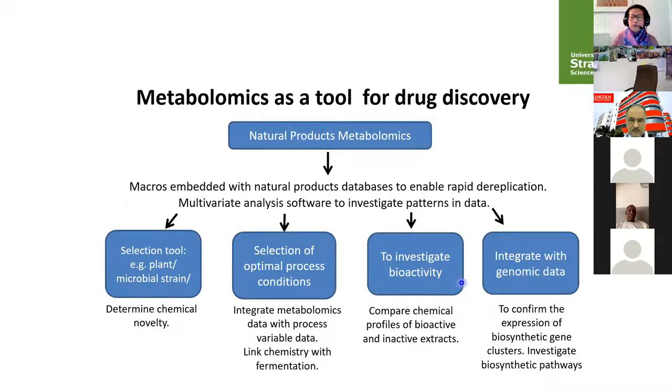Third, very important is to investigate bioactivity. So with multivariate analysis, we are able to compare chemical profiles between bioactive and inactive extracts. And lastly, it is to integrate our data with genomic data and to be able to confirm the expression of biosynthetic gene clusters. In this way, we could further investigate and optimize the biosynthetic pathway.